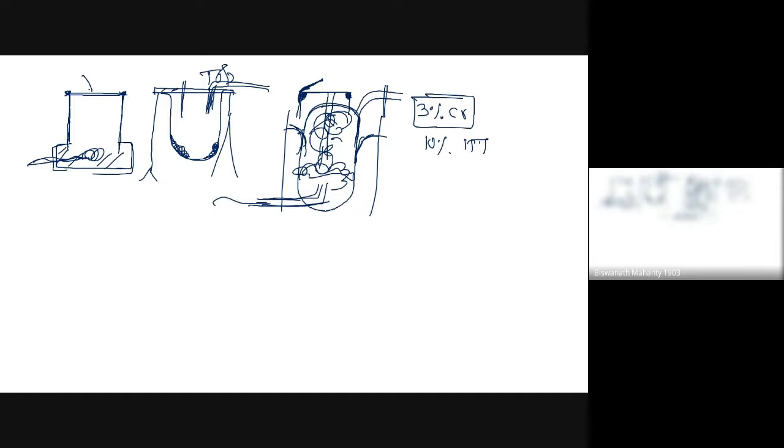The chromium in stainless steel gives resistance to abrasion. So everything is moving, right? There will be no scratch on the steel surface inside. So it is more resistant. It can withstand much higher pressure and the tensile strength is much higher. So if I go for a stainless steel module, it is always preferable when I am looking for a fermentation process.